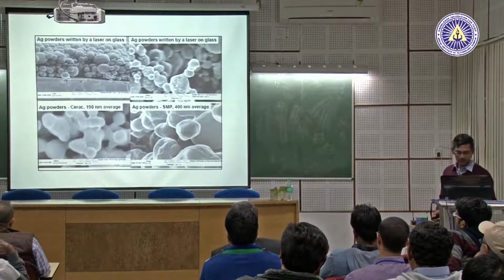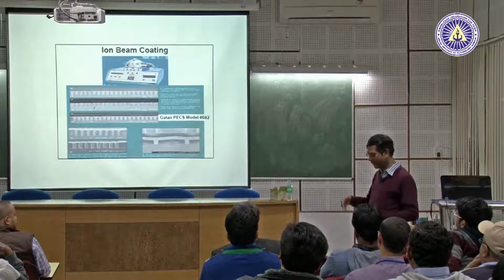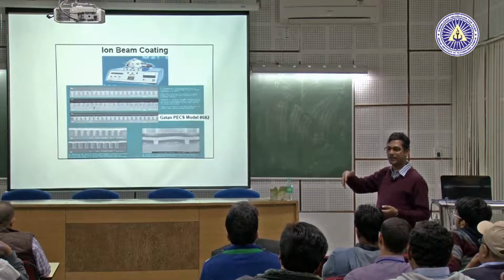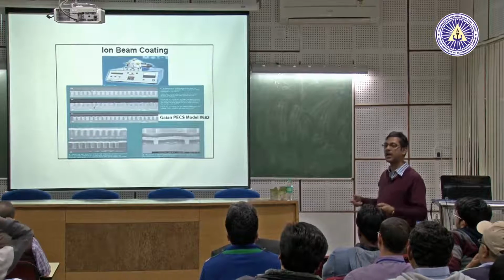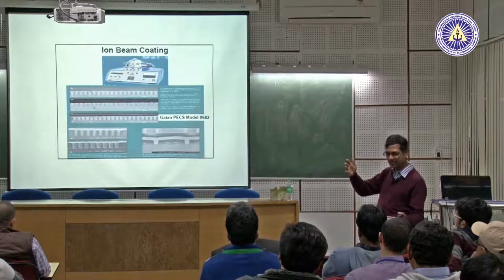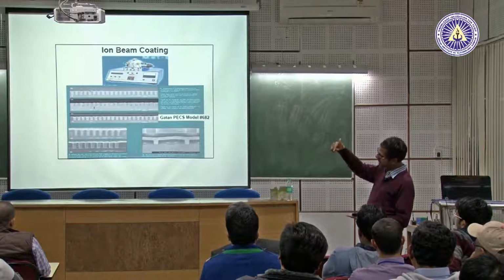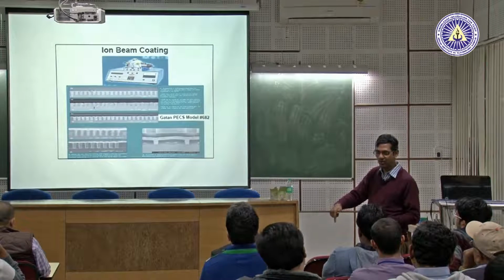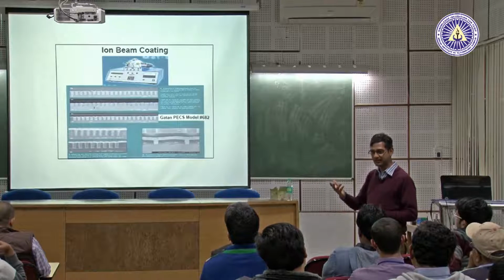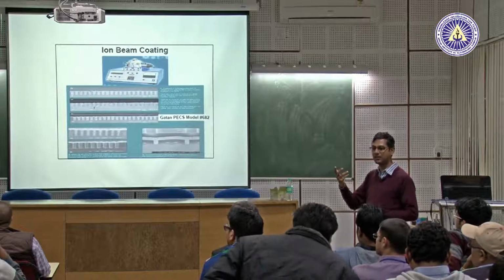How is this sputtering? This is a sputter coater. Sputtering is nothing but you have a gold palladium source and you have argon ions. You have seen, no, they put argon gas inside it, and if you apply a large voltage, not large, 3 to 4 kilovolts, so argon ions will be energized, and then they will hit this source on which you want to deposit thin films. So by sputtering, which is a physical vapor deposition process, this is sputter the gold palladium.